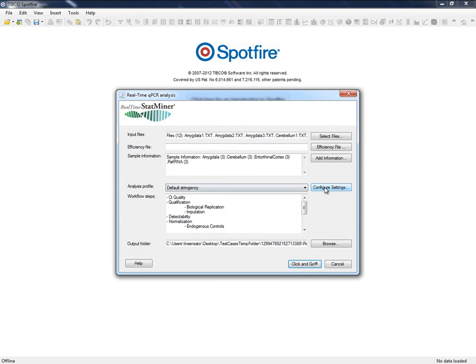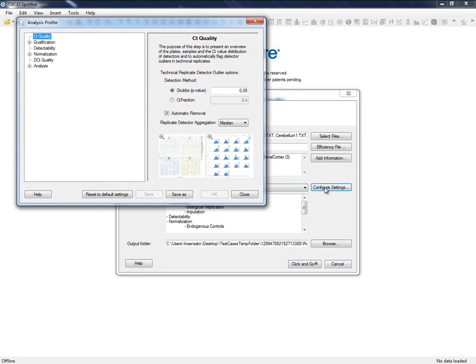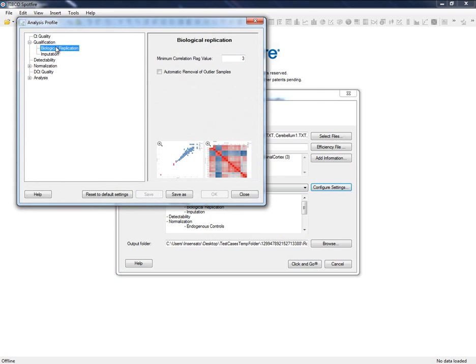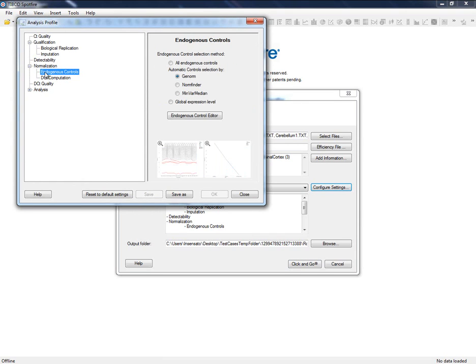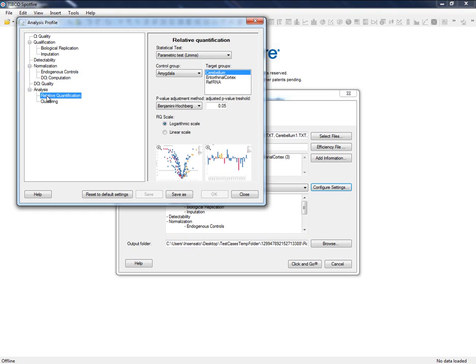Let's first have a look at the Analysis Profile tool from where we can modify and configure the set of parameters and quality control of the analysis. For instance, this tool defines how to deal with the technical and biological replicates, how we want to flag expression values that have been poorly amplified, how to choose the best set of controls to normalize our CT data, and finally, the settings and configuration of our relative quantification and classification analysis.